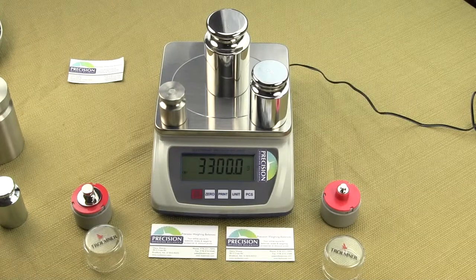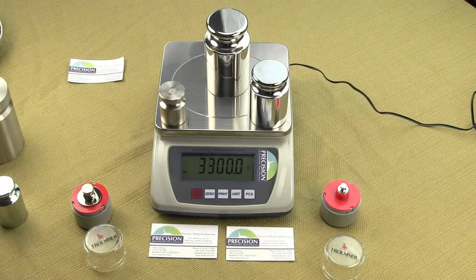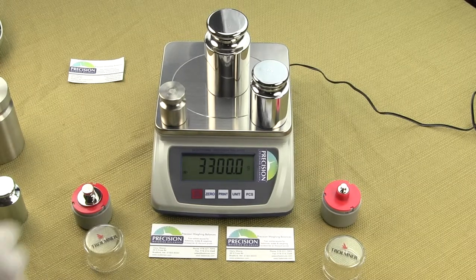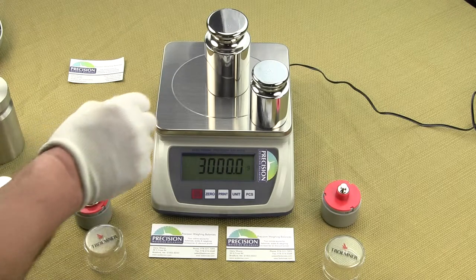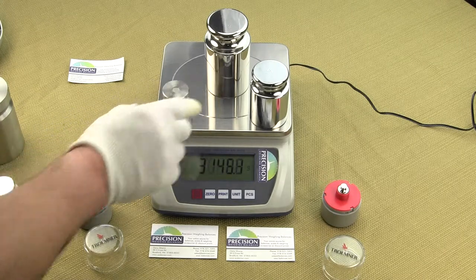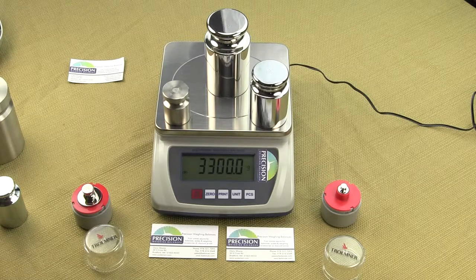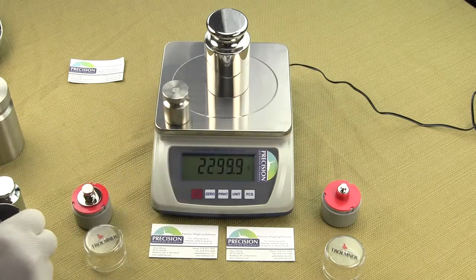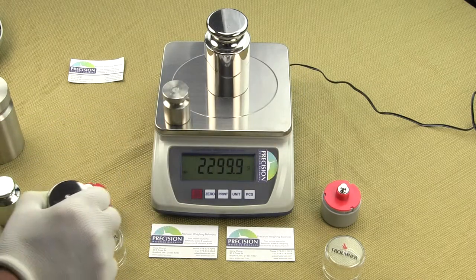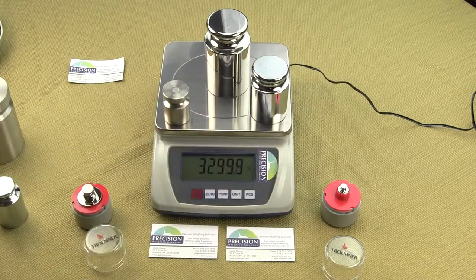This video is on the EPB10K from Precision Weigh-In Balances. You can order the EPB10K from our website, either balances.com or scaleman.com. The EPB10K is an affordable compact digital scale offering a huge 10,000 gram weighing capacity and increments in one-tenth of a gram readability.